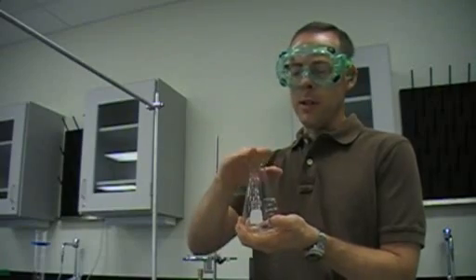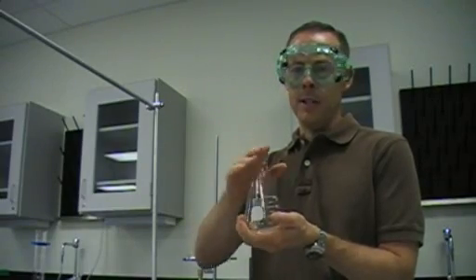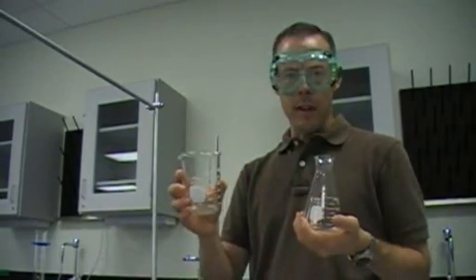For other things, stoppers can go on flasks a lot easier if it's something that needs to be sealed. It's very difficult to find a stopper big enough to fit a beaker.